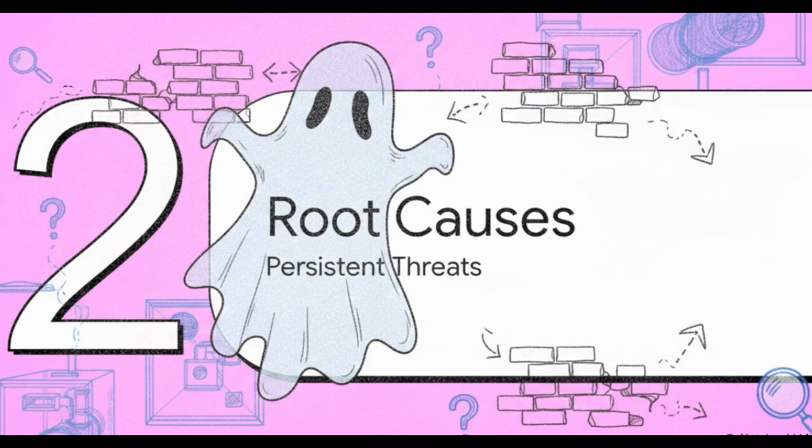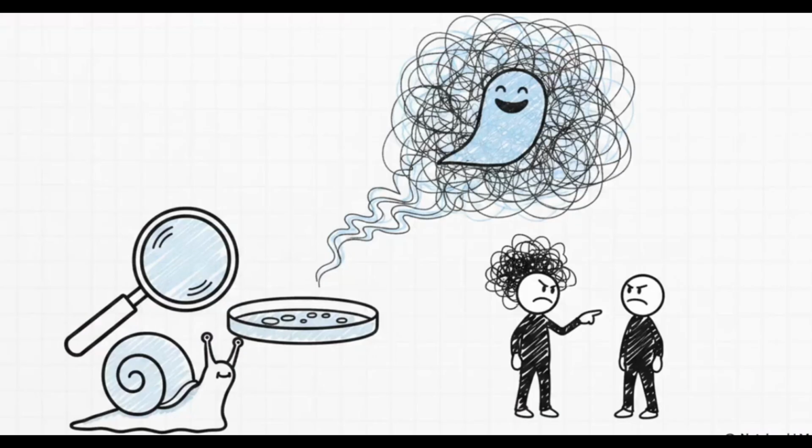Moving on to part two, root causes of persistent contamination. So why do traditional investigation methods just keep hitting dead ends? Why do we keep failing to see what's right in front of us? You see, old-school detective work relies on static snapshots, and those just can't capture the complex, three-dimensional airflow dead zones or the thermal gradients where these problems hide.